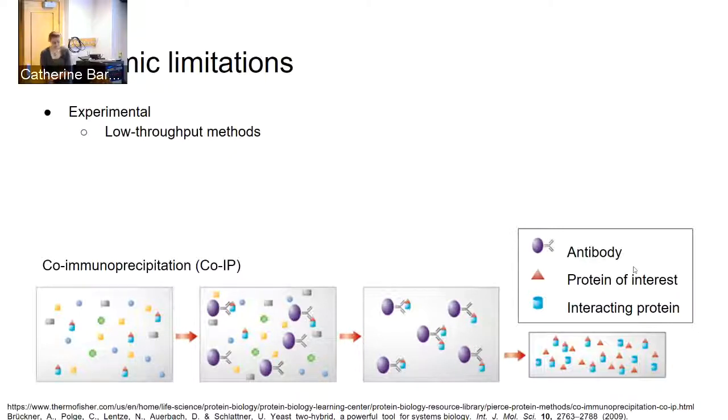So let's say you have a putative interaction of protein A with protein B. So you fuse protein A with a protein that has strong polar localization, which means in a bacterial cell, it will get stuck way on one end of it. Then you fuse protein B with an intact fluorescent protein. And then you look for polar localization of the fluorescent protein that's attached to protein B. And this has been shown with really good negative controls not to have the kind of noise that you get by splitting fluorescent proteins, for example, because there is no intrinsic affinity between the fluorescent protein and the polar localizer.